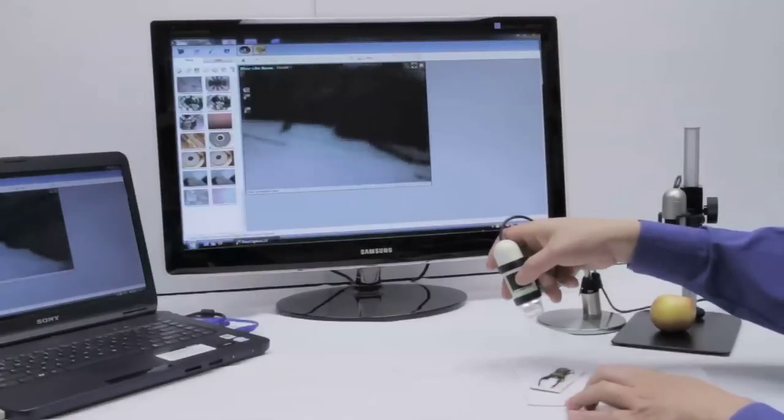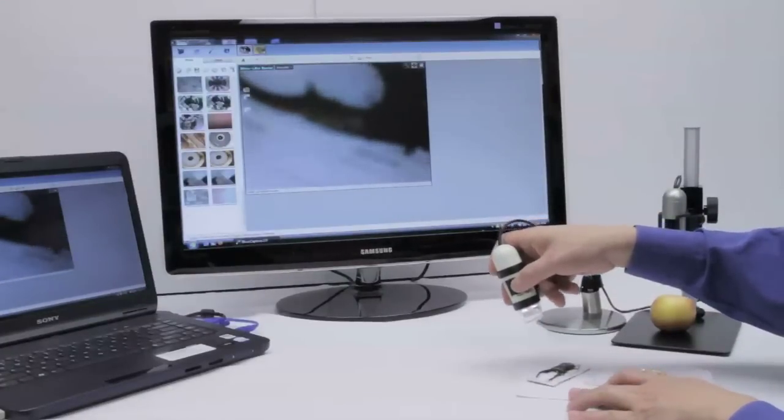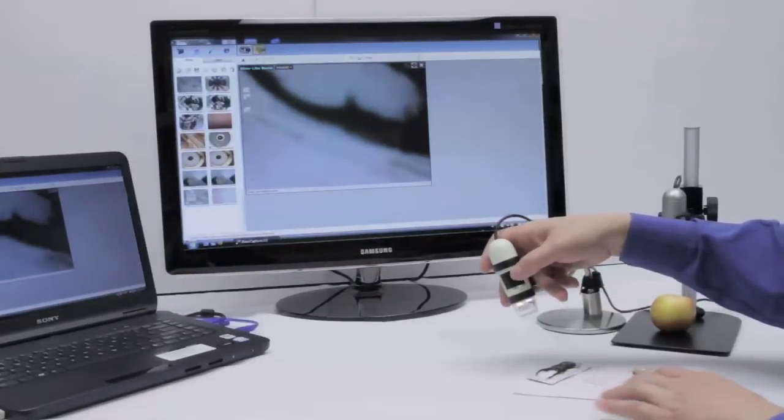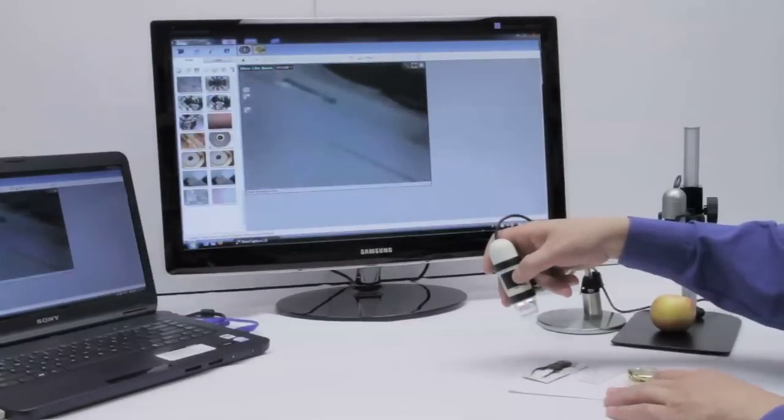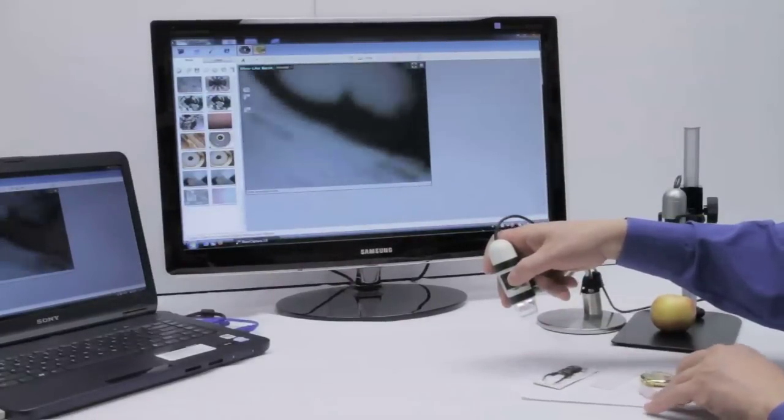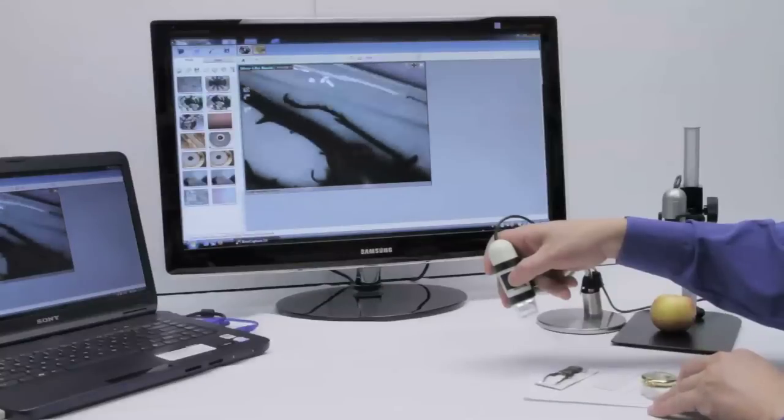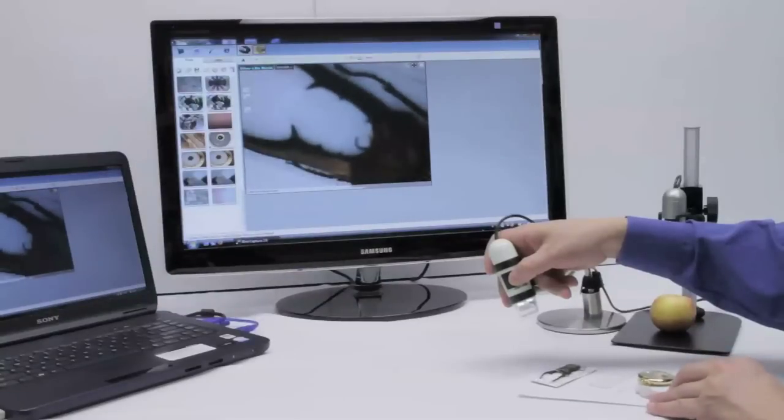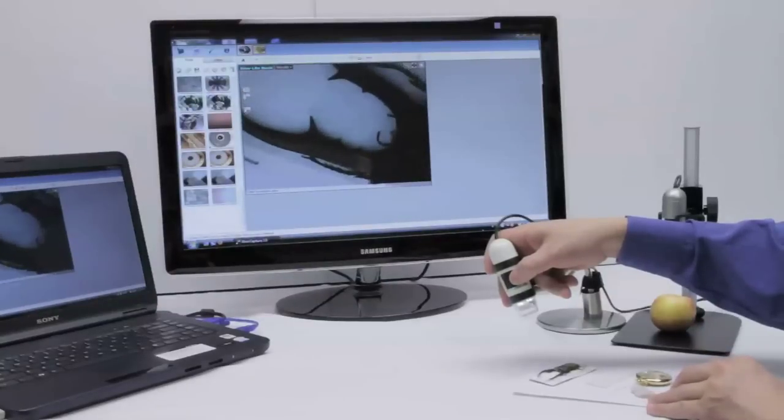To magnify the image we simply get closer to the subject, then by turning the black dial on the side you will focus on the image.